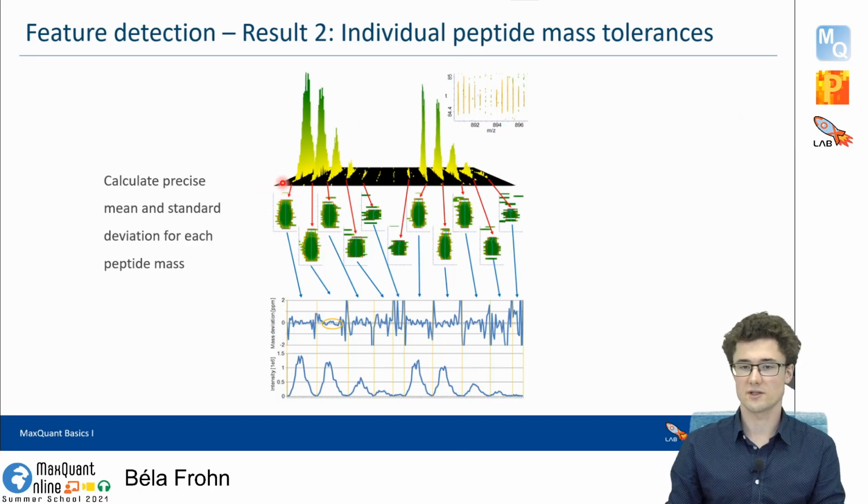And also, as we have many data points, we can calculate the variance or the standard deviation on how good we estimated this mass. This is really interesting because on these descriptive statistics, like the mean and the standard deviation, we will base our algorithm that searches for a peptide which might have given origin to this pattern.